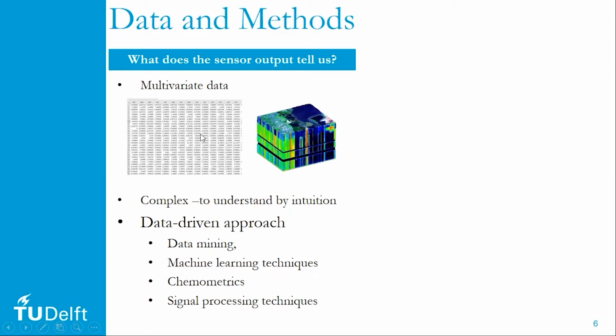Actually, the mid-wave infrared data has more than 5,000 variables, and this shows only a small part of the data. And this is a hyperspectral image that provides both spectral and spatial information. But just by looking at this data, it's difficult to tell what's inside this data, what kind of information we can get from it.